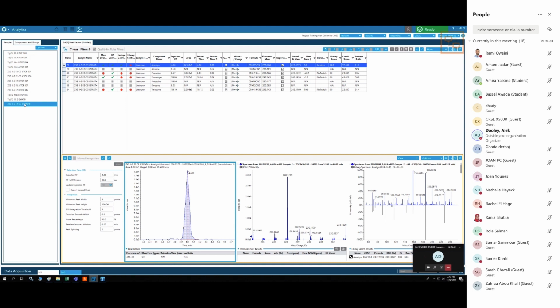That can make sense. Yeah, because we are trying here to see some trend that is repeatable, and we don't see anything. Yes. Probably the water dropped. Okay. All right.